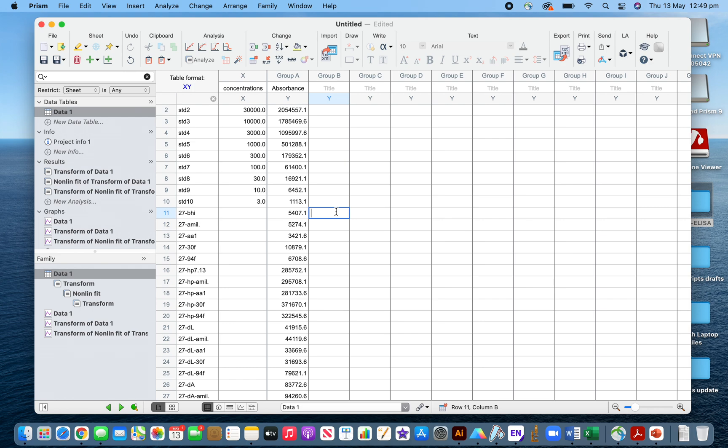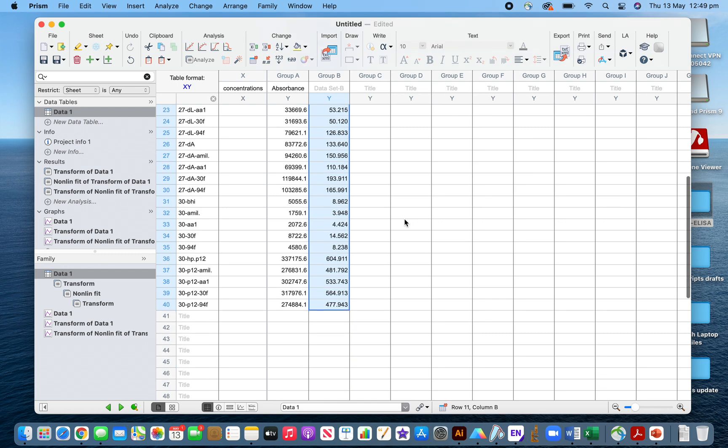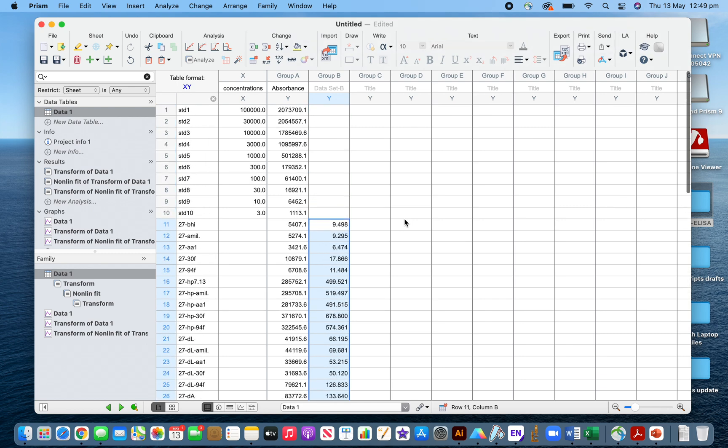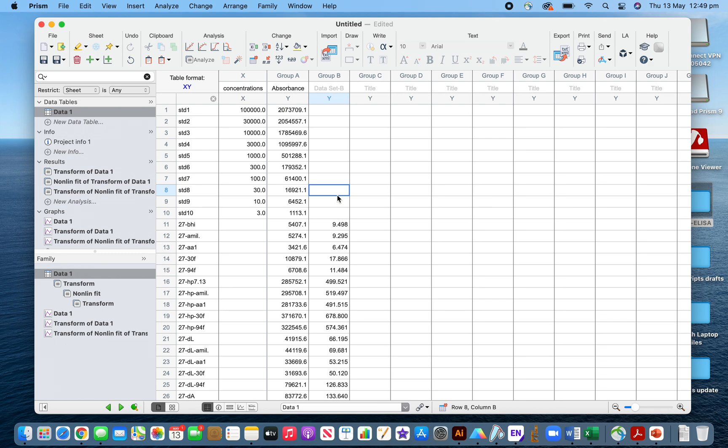Then you have to multiply by the dilution factor you did if you diluted the samples before using the alpha ELISA assay. I did five times dilution, so I need to calculate this into five times.